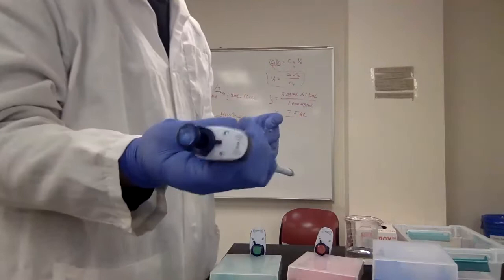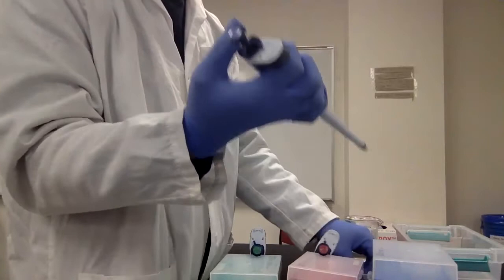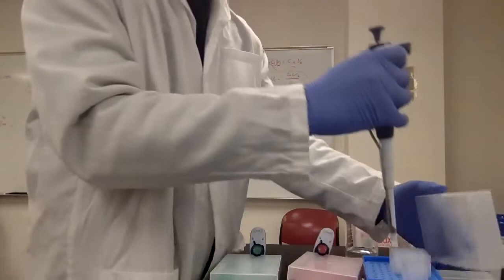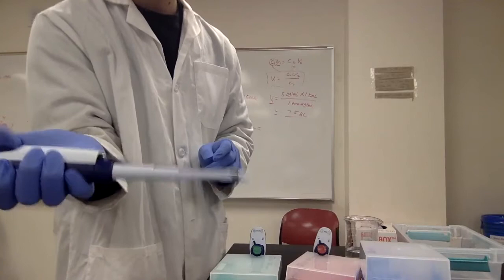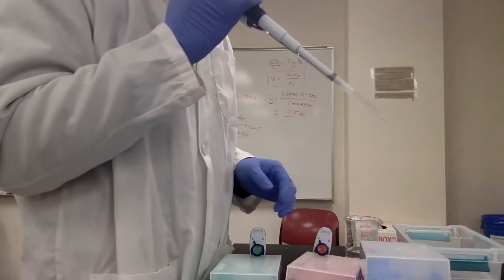So after you transfer your liquid, you can eject the pipette tip by clicking this button over here. Let me do it again for you. You just push this button from the side and you will eject the pipette tip. Make sure you toss this pipette tip into the biohazard waste.